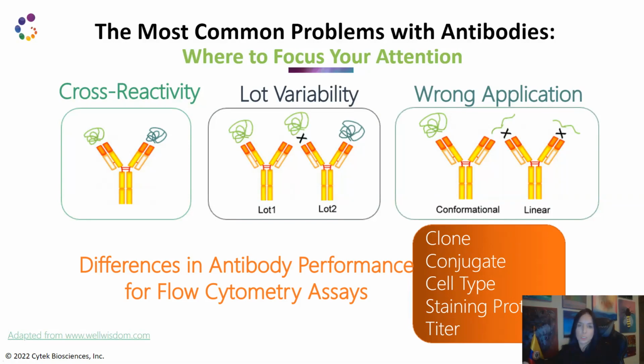What clone you're using, not only because that's what's giving you the specificity, but also because some clones tend to aggregate more. For example, the conjugates, the type of fluor, but also its stability, the cell type, that's a critical part, that's where the antigens are going to be expressed for then antibodies to bind.